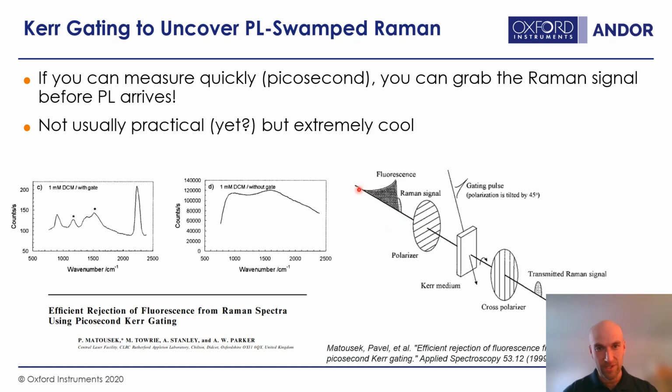So here's the direction of propagation, and I just love this diagram. Here's the fluorescence, and this is kind of time, right? So the time's in this direction. Our Raman signal is coming promptly before the fluorescence, and I imagine very vividly Indiana Jones running away from the front of the boulder. So the Raman is just booking it as quickly as possible ahead of the fluorescence. So if you can snip this time point off right here, you can actually capture the Raman very quickly.